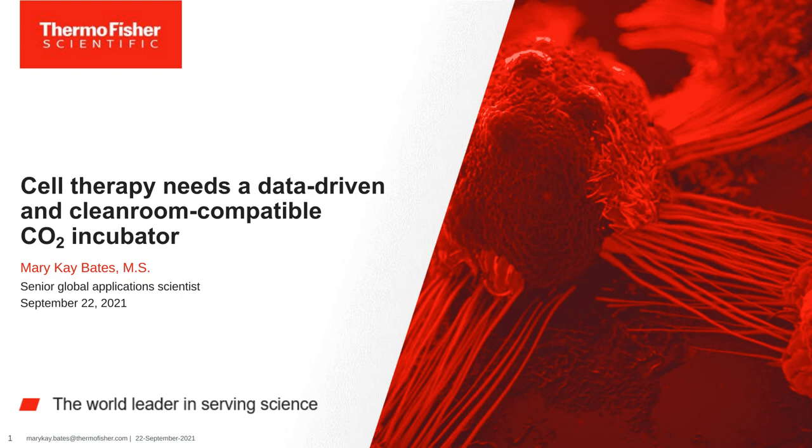About a year ago, I gave a talk in this forum about the critical incubation parameters for cell therapy, how they affect cultured cells, and the effect that different incubator designs can have on culture conditions. Near the end of my talk today, I'll review a few of the points of those data that I presented a year ago. But interestingly, most of what I'm going to talk about today is about the clean room environment and how that affects the CO2 incubator, such that the incubator requires additional safeguards beyond those in an R&D lab. Also, the CO2 incubator can provide documentation that helps ease your path through regulatory audits.